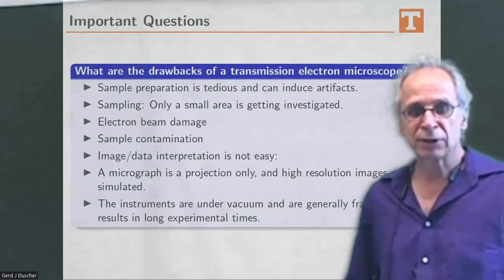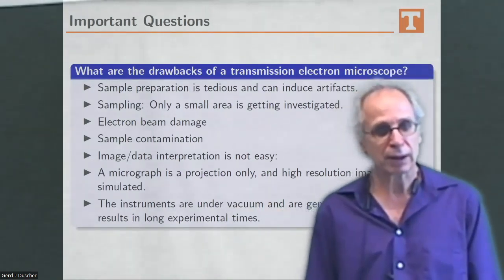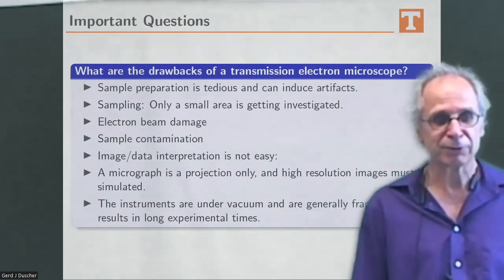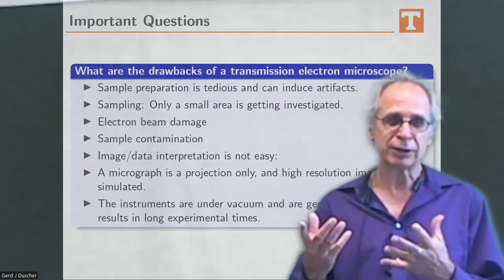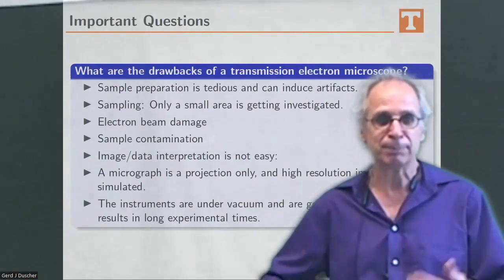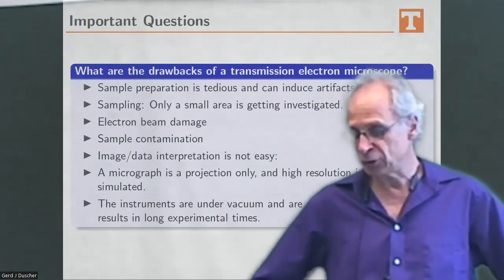And TEMs are... the funny thing is, the biggest challenge for new users on an electron microscope is how to put the sample in, because of the vacuum issues.